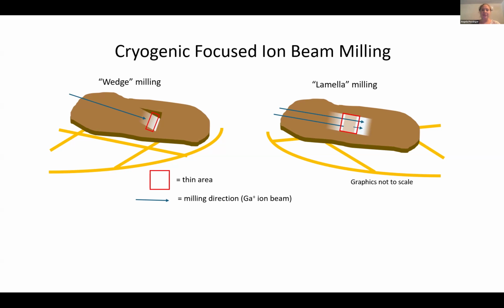And so this, again, is a fairly time-intensive and finicky process, and maintaining cryogenic conditions from thinning into the FIB takes some specialized equipment. So this is where we really had to lean on collaborators in the material science program to help develop these techniques.